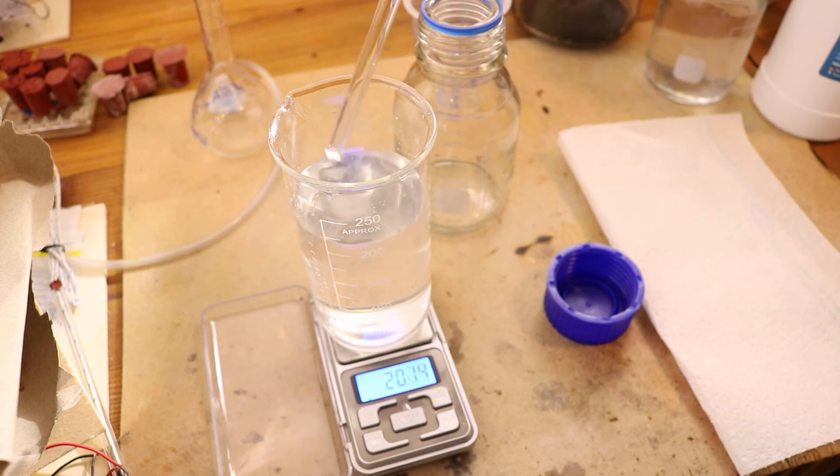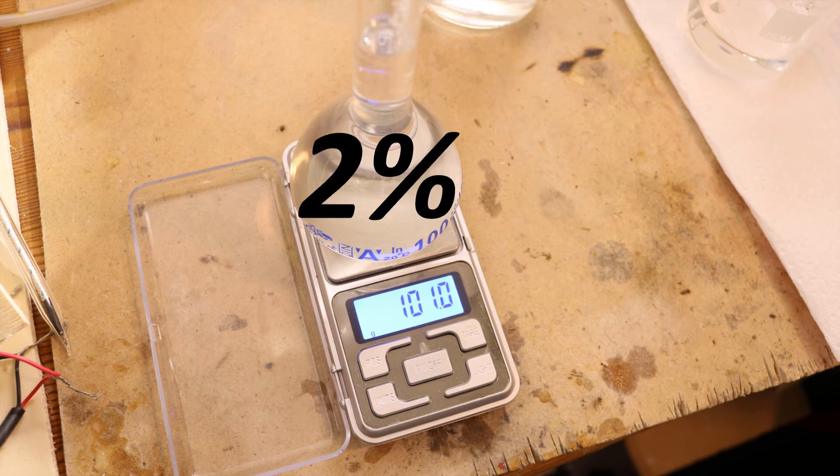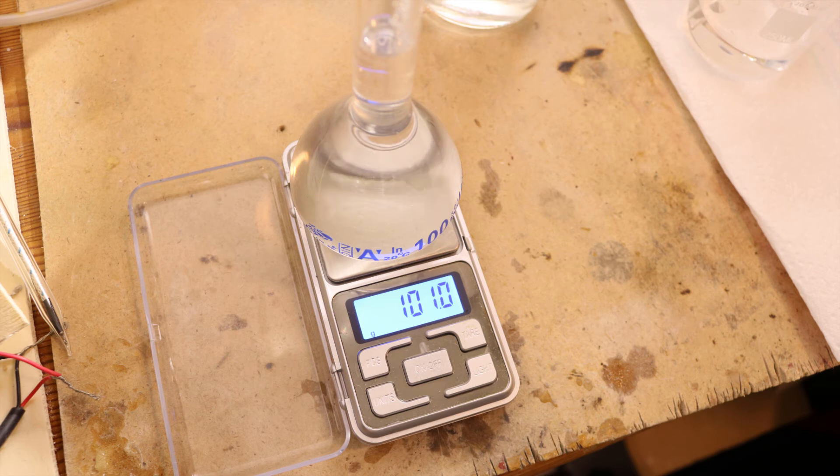By using the right amount of hydrogen peroxide I oxidized the sulfurous acid into sulfuric acid. Now you may ask how high is the concentration. I used the density to figure that out, and I had 101 grams per 100 milliliters, which corresponds to 2% acid — which is not much. However I probably could have dissolved more gas into the water, but there is another way to get a higher concentration, and that's by boiling it.